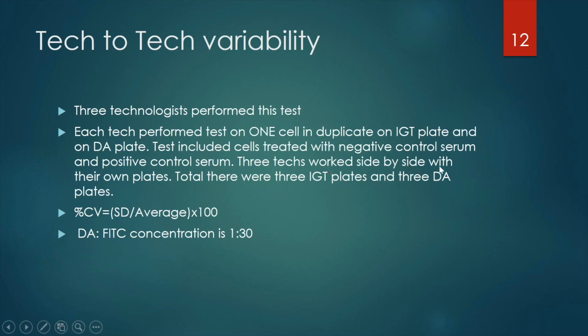And the 3 techs worked side by side with their own plates. So this happened at the same time. So they were all working side by side. It's not that one did in the morning, one afternoon, one in the evening.